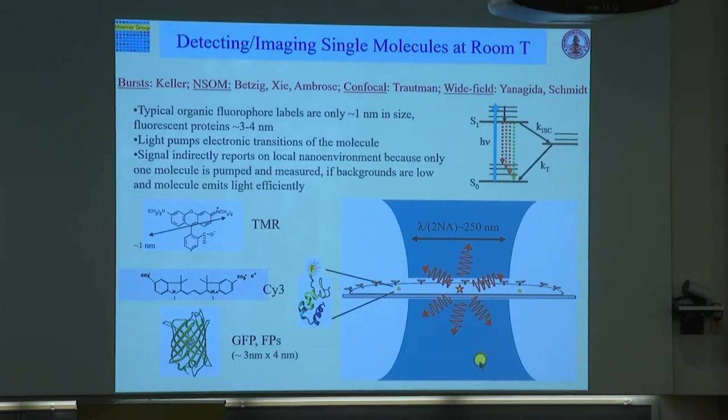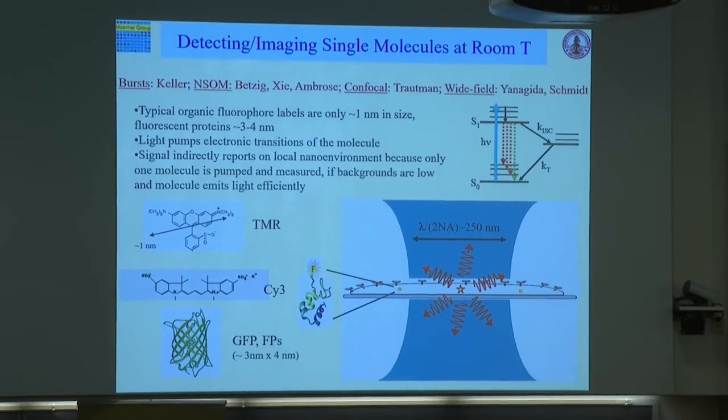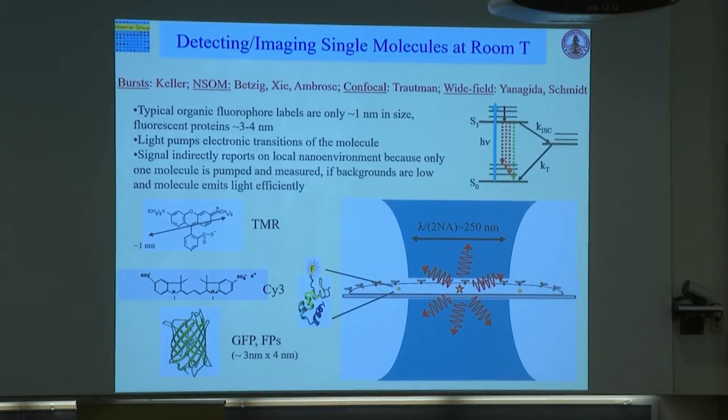So the experiment, you can think of it as focusing a laser down to a small spot, but you may know that due to diffraction, you cannot make this spot infinitely small. It cannot be smaller than lambda over roughly 2 times the numerical aperture of the microscope. Numerical aperture is about 1, so this is the diffraction limit of visible light if you're using, let's say, 500 nanometer light, green light. And so that is a fundamental property that's coming from physics, coming from diffraction itself. So you might say, well, that's huge compared to the size of these molecules, but no problem. You can still get to the single molecule limit. Just dilute them. Just make sure they're further apart than the width of this spot so that now the emitted light is coming from just one molecule being pumped. Okay? So that's the kind of thing you have to do at room temperature to get to the single molecule limit, but we'll solve that problem in a moment as well.